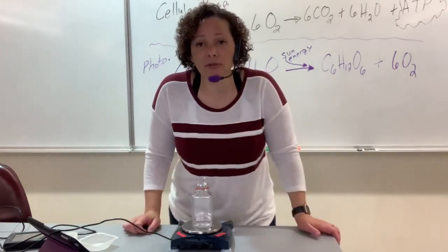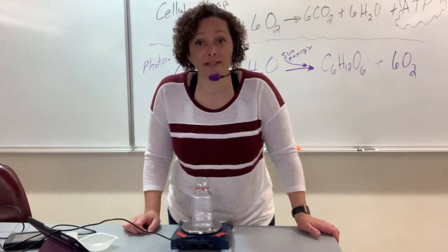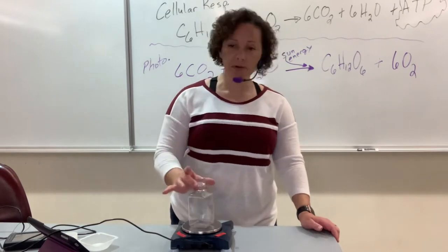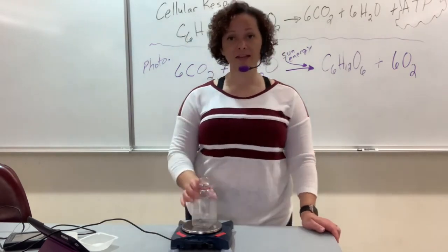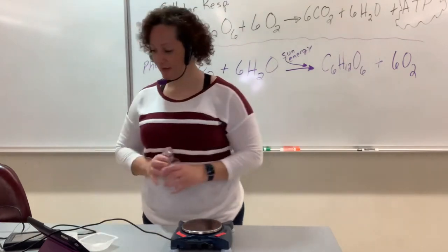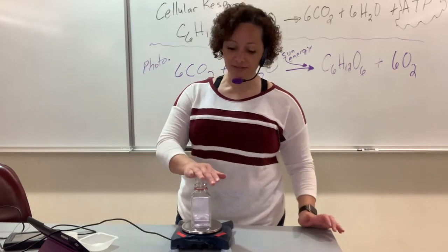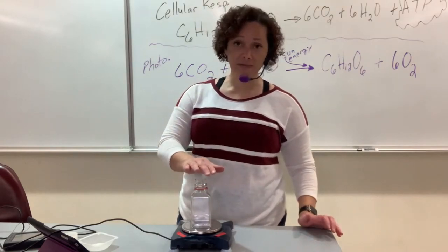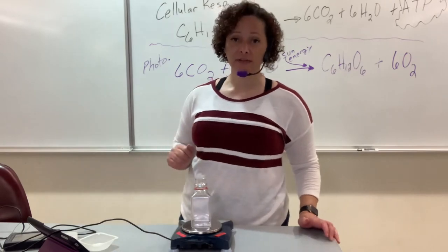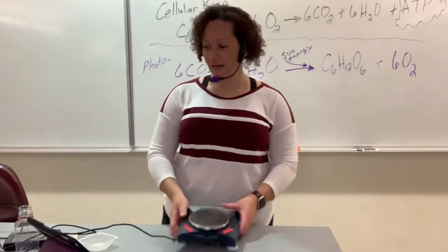Yeah, sometimes the roaches, sometimes the crickets, they do not cooperate. So what you're going to have to probably do is get the mass of the chamber by itself, okay? Get your roaches and your crickets, get them in there. Try not to let them out. Try not to push on it. And then get the mass of them with them in there. And then you calculate the difference. So I'll let you work that out. It's real fun. All right.